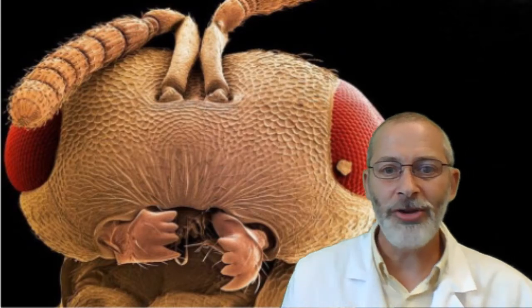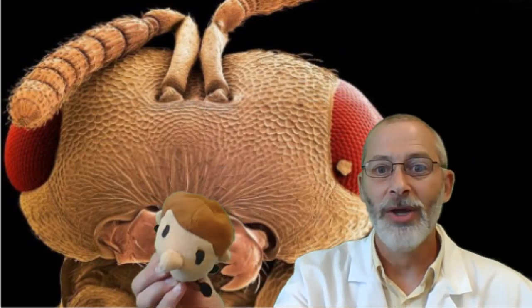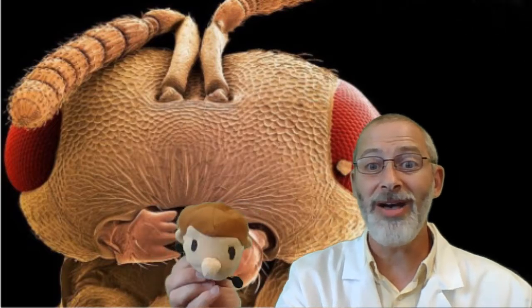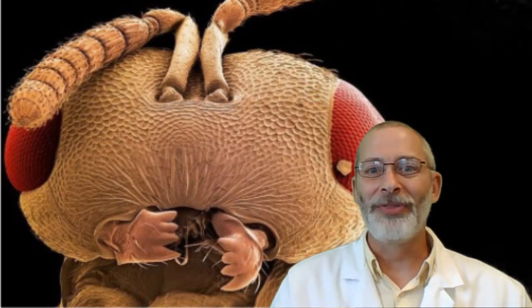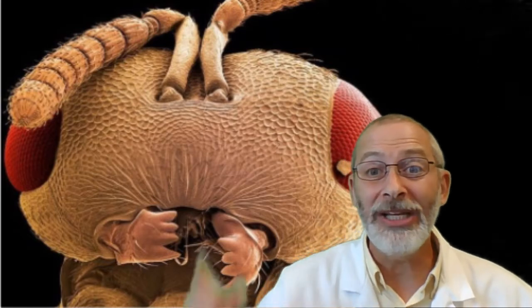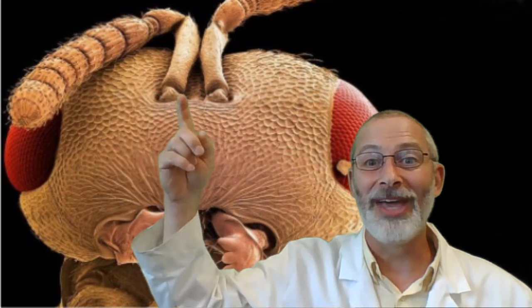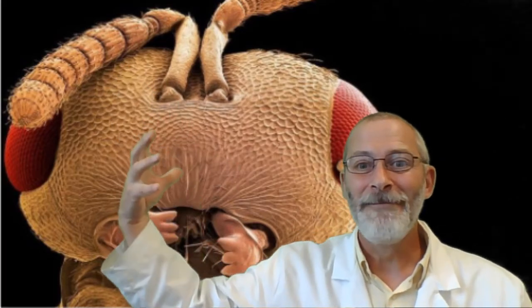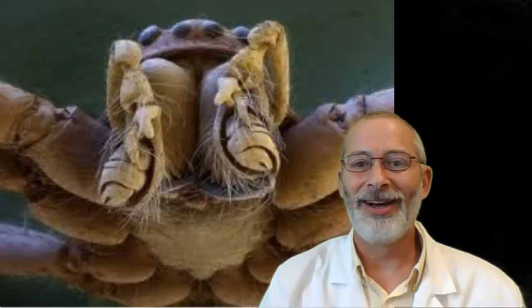I wonder if he's hungry. Should we give him something to eat? Here, let's see if he's hungry. Ooh, oh. No, I guess he's not hungry. Okay, but that's the mouth of an ant viewed really close. And check out his antennae up there, how wild they are. Oh, it's like a big teddy bear. Don't you want to just give him a big hug?